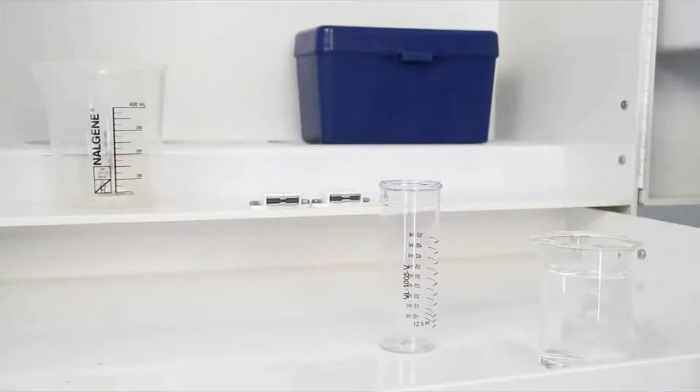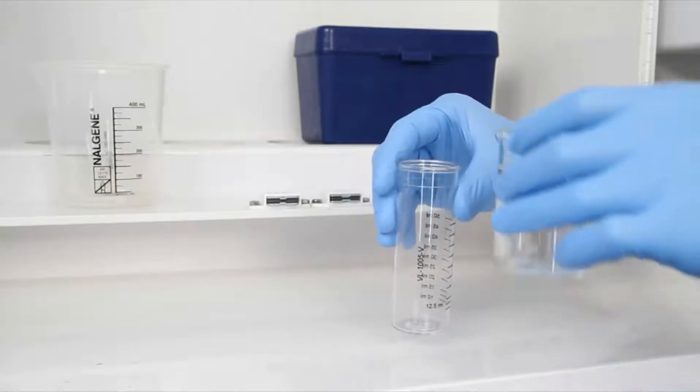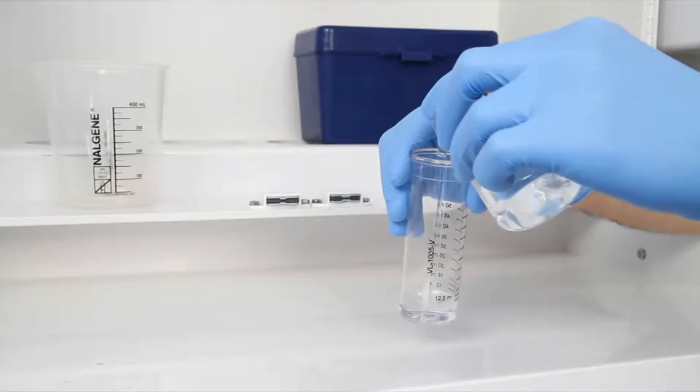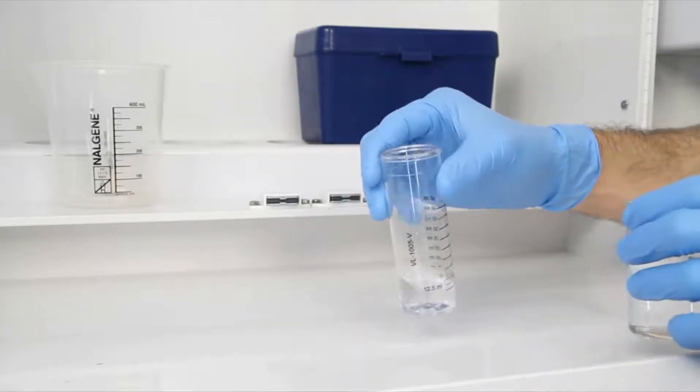The first step according to the Endpoint ID procedure is to gather an accurate sample. The smallest change in sample size will lead to inaccurate results.